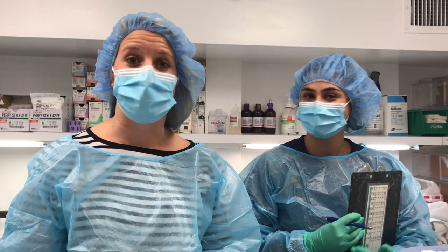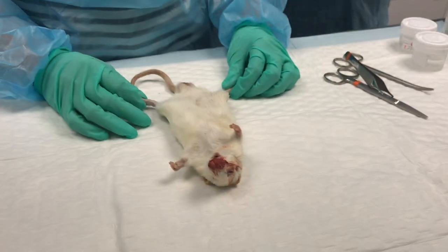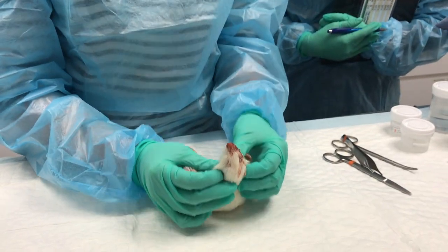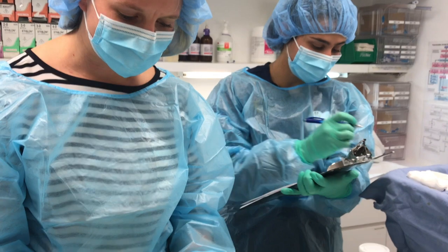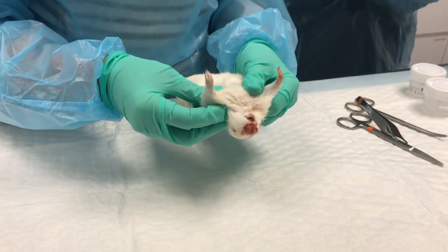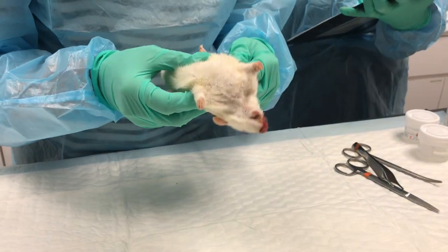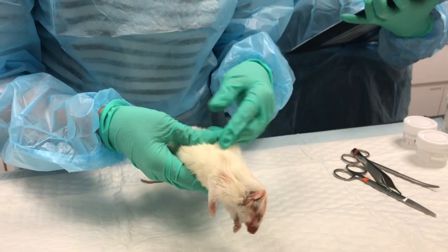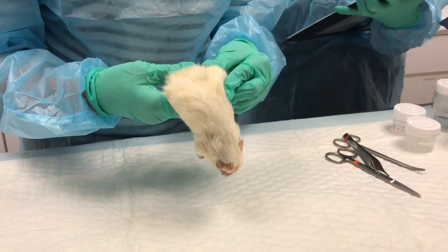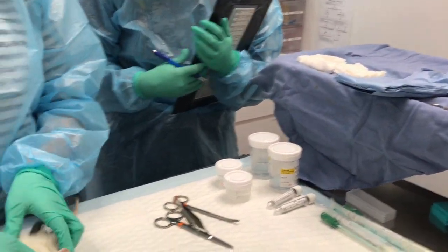This is a necropsy of a rat. Okay, so this is an adult male rat with blood coming out of the nose. So just make a note of that. I don't really see anything else. There is a slightly dirty coat. No other wounds or contusions anywhere.